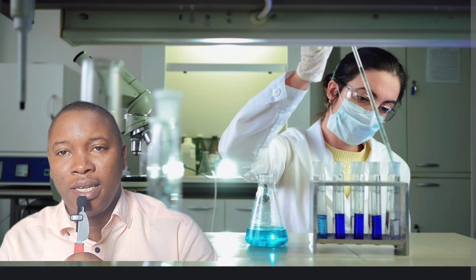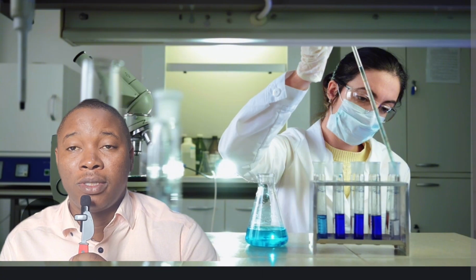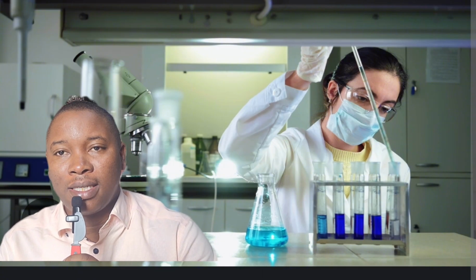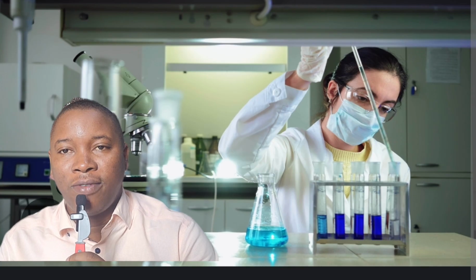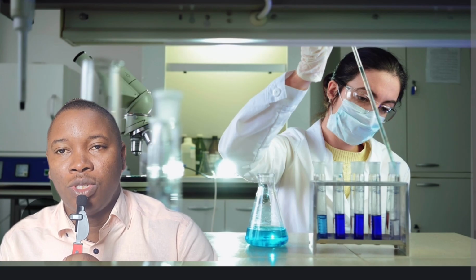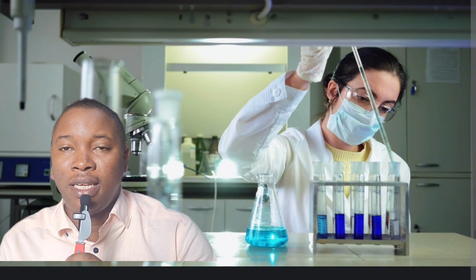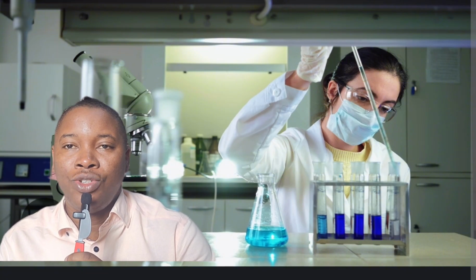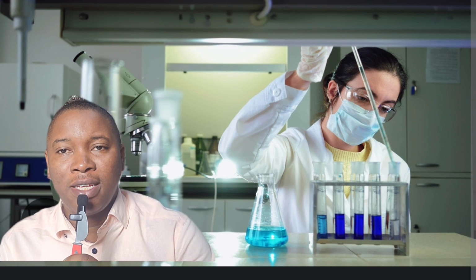Today, we are talking about the Indole Test. This is one of the biochemical tests, the way we use different biochemical tests to identify different bacteria in the laboratory, which is core to what we do in microbiology. The Indole Test is one of the tests used in a battery of tests that we refer to as the IMViC tests.